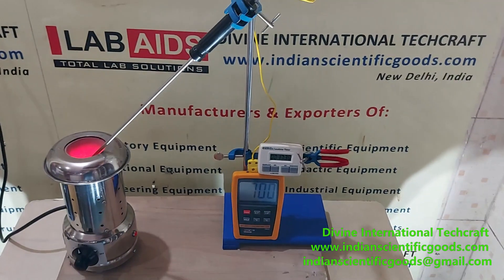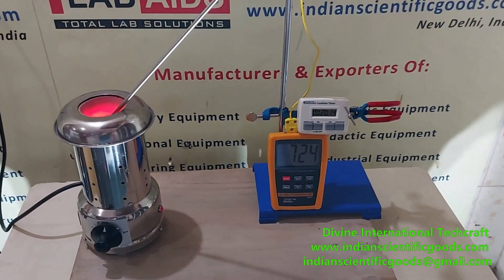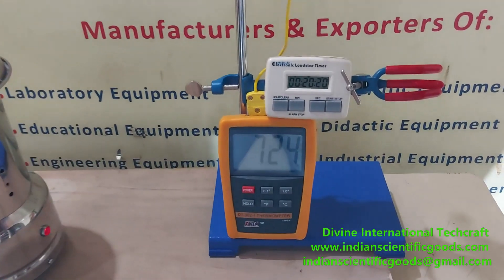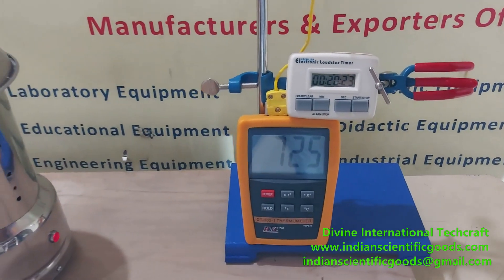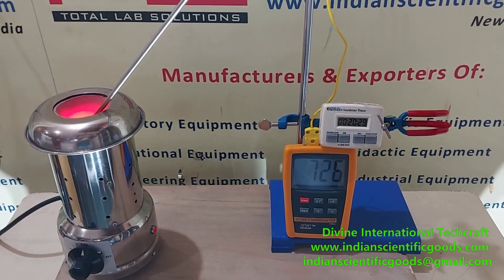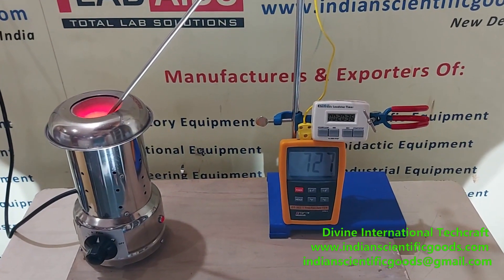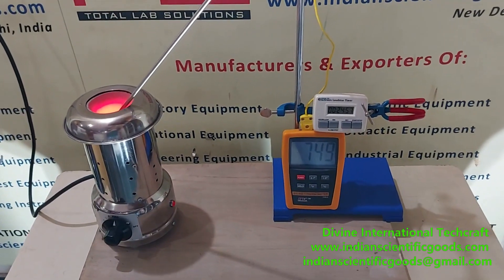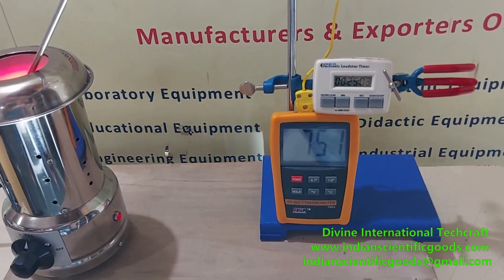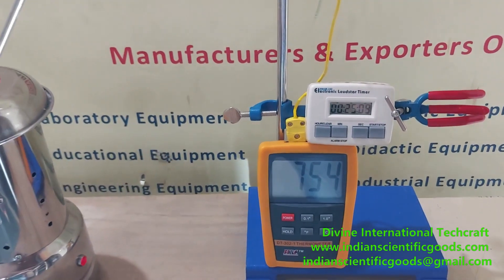You can see that it has now reached a temperature of about 724 degrees centigrade in 20 minutes. It is 726 degrees centigrade and still increasing. The electric Bunsen burner has reached a temperature of 750 degrees centigrade in about 25 minutes, and it is still increasing gradually.